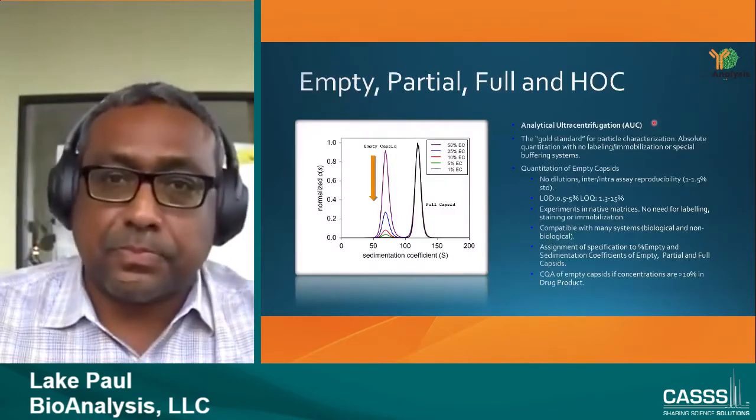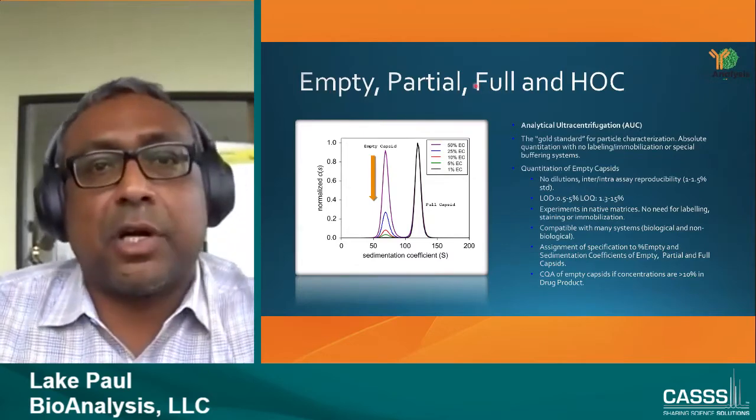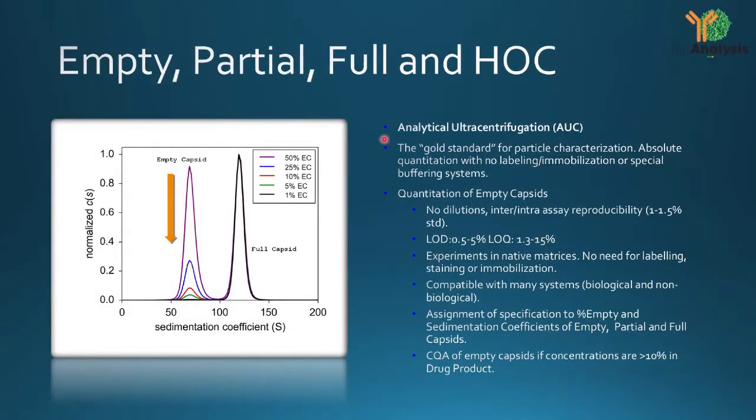So moving on. Usually empties, partials, and fulls can be done very easily with AUC. You have no dilutions, no labeling, no nothing. It's a first principle based technique.